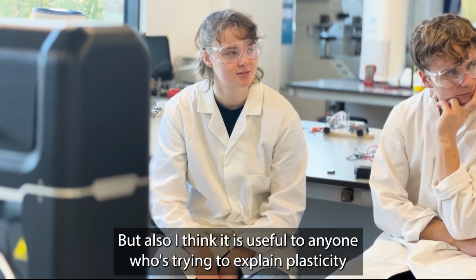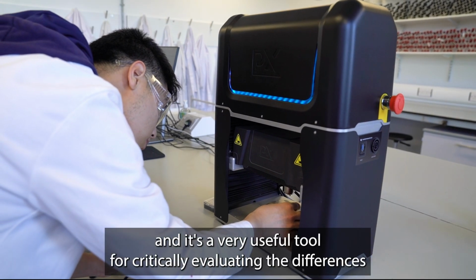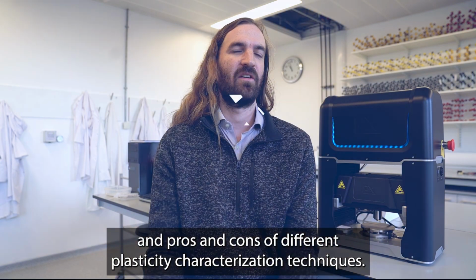But also I think it is useful to anyone who's trying to explain plasticity to people who want to get a deeper understanding of it. And it's a very useful tool for critically evaluating the differences and pros and cons of different plasticity characterization techniques.